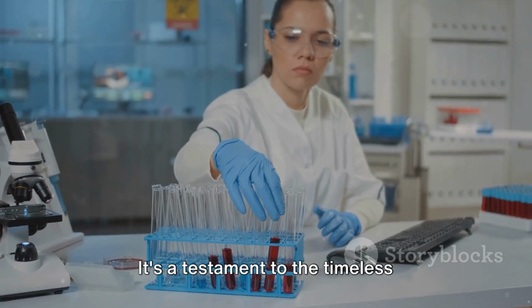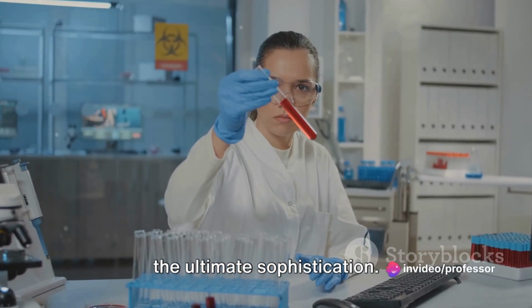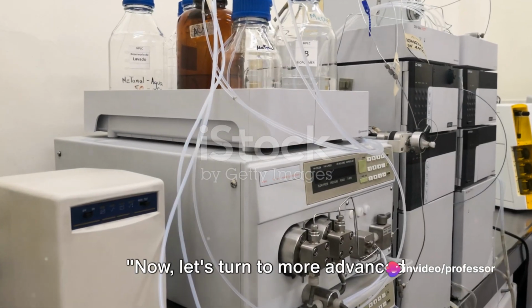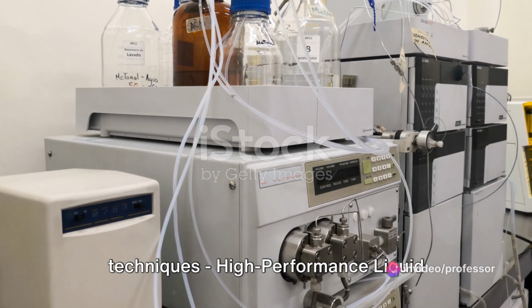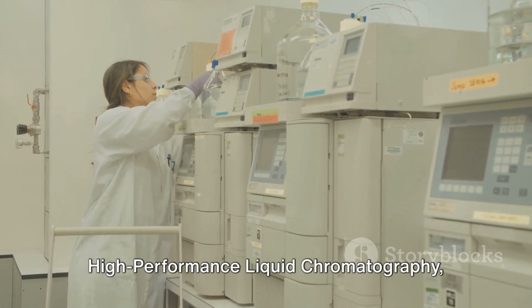It's a testament to the timeless principle that sometimes simplicity is the ultimate sophistication. Now, let's turn to more advanced techniques: high-performance liquid chromatography and high-performance thin-layer chromatography.